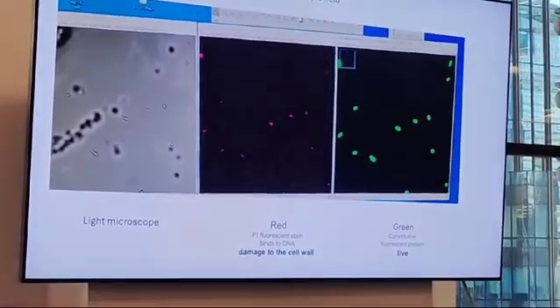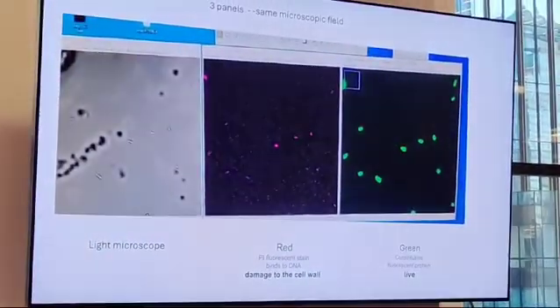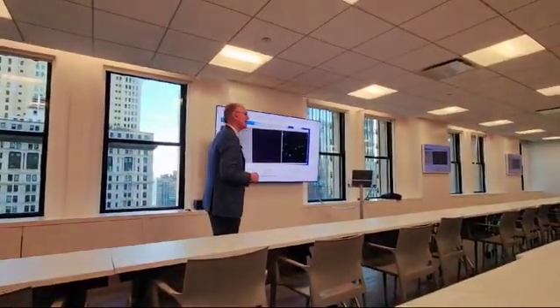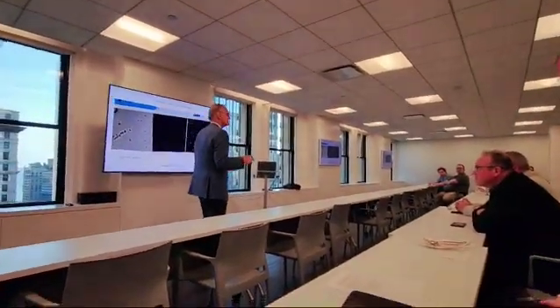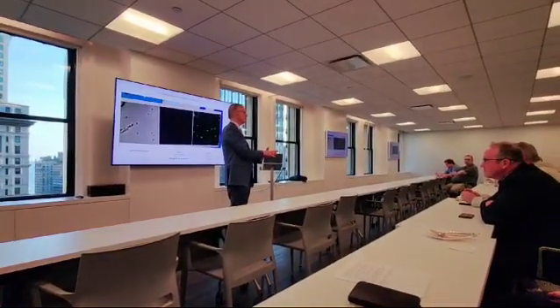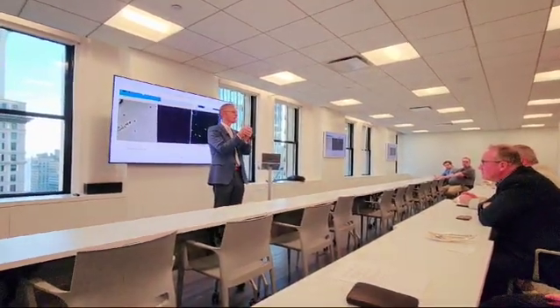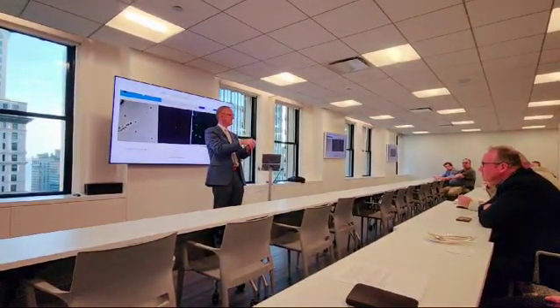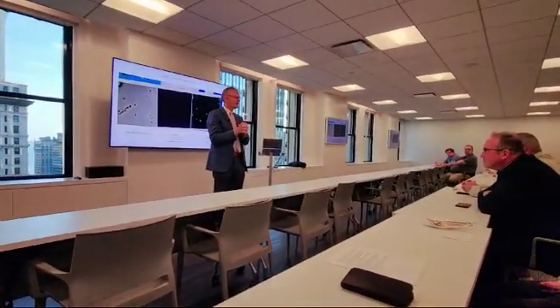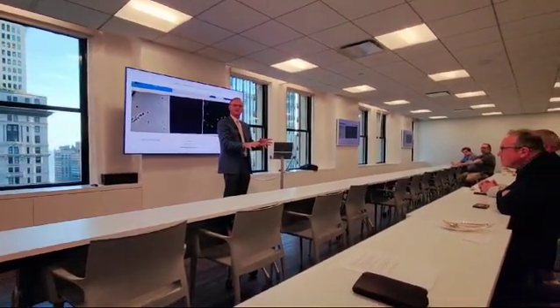Okay, so that is our Alexander Fleming moment. Anybody have a question? Yeah. What fixes them? It's a charge. It's like a magnet. They go right to the particles. They're falling on a spear. They're just falling on a spear. They get pierced, so to speak. That's how that works. You saw how they were just kind of floating. All of a sudden, they kind of stopped.